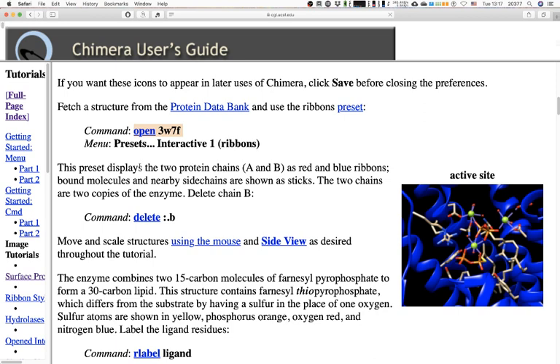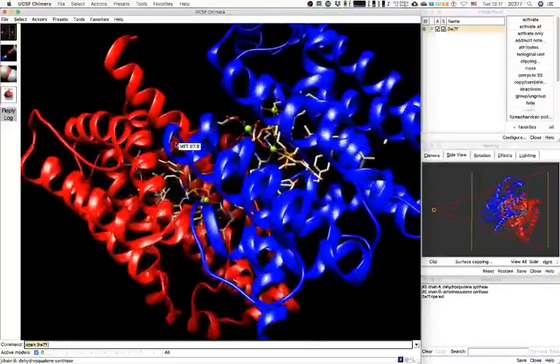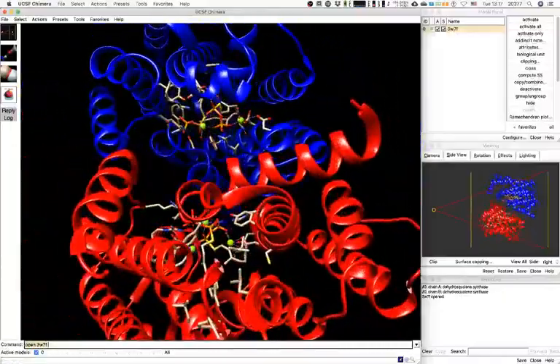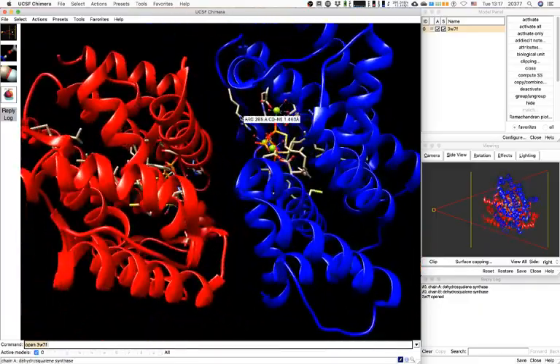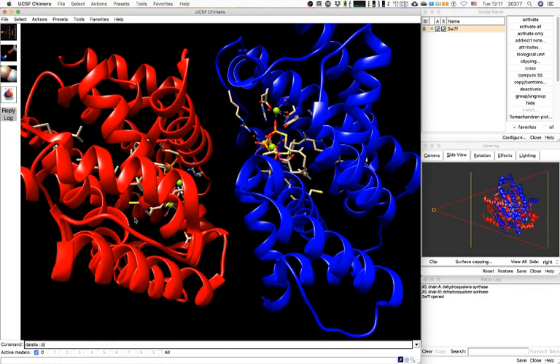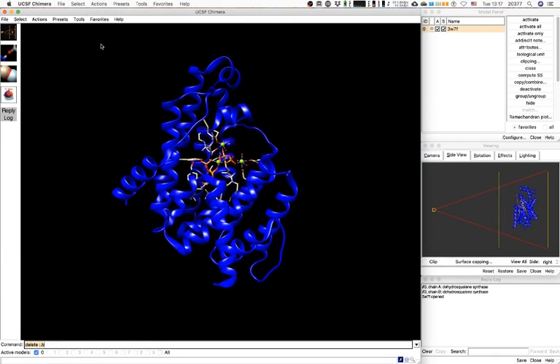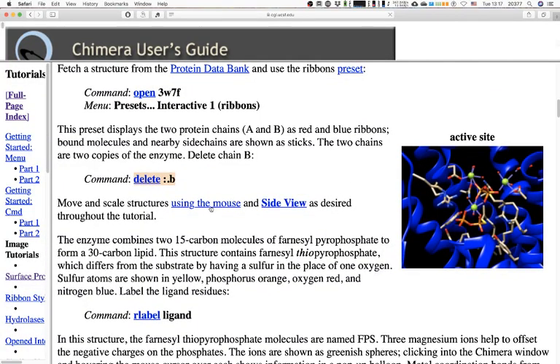These presets display the two protein chains A and B as red and blue. Bound molecules and nearby side chains are shown as sticks. The two chains are copies of the enzyme — sometimes they are identical, but not always. We can see clearly the magnesium ions in the binding site. It says we can delete chain B, so let's go ahead and do that. I'm going to use Focus to recenter the view.